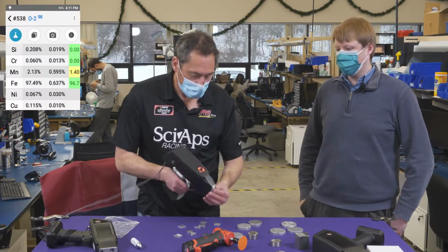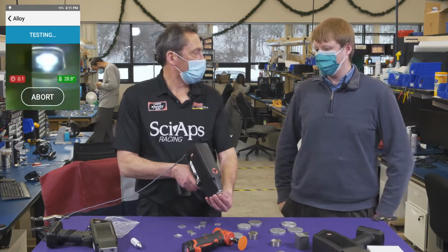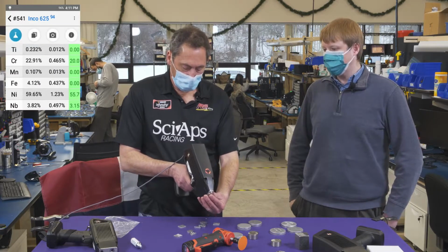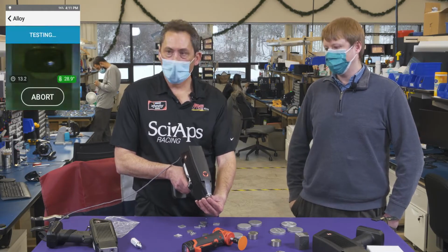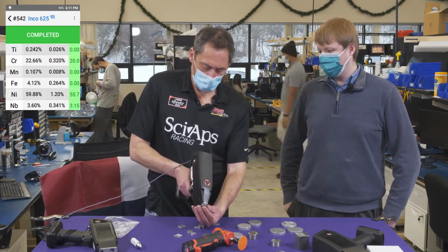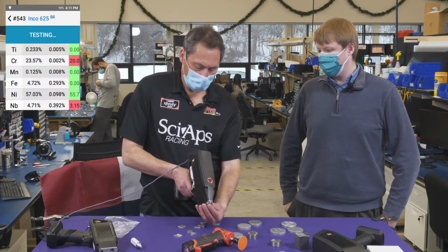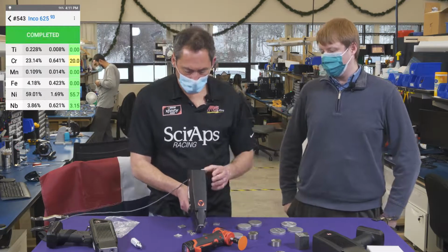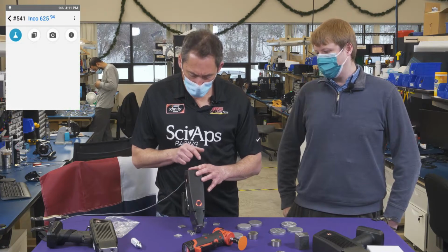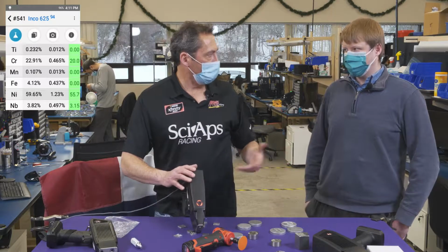Okay, let's go back to our nickel alloy. Let's see how we do there. So again, you probably expect a little better precision on nickel on the high temp alloys with argon, right? So let's see, we'll do it 3 times on the 625. One more test. All right. Let's see what we do here. So like 59, 59.8, again, within 0.8%, 59.6. So if you take the average, they're all within about 0.05% or so.